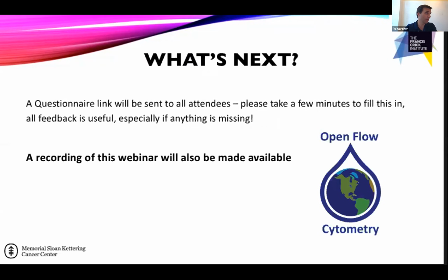Right. Yes. First, I'm getting a lot of good suggestions for the next topics. Many of them were in the survey that we sent out, and so a lot of these topics are going to be covered, like compensation. Somebody's talking about setting up voltages. Somebody also asked, and this is something that we can maybe record, to see Kathy doing a session on tips and tricks in Diva, because I think they liked some of the tricks that you show there.